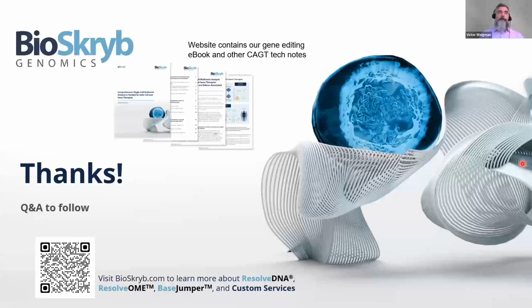Yeah, so again, this is a kind of toy first pass example. The EMX1 was chosen as a known, fairly specific, published edit guide, to say, hey, we're going to make changes in this one exon. I showed the one exon there, and we hit every single cell that we expected. So the edits are working. They're hitting the cells that they want to. Awesome. So we know that it was supposed to be specific, and it was.